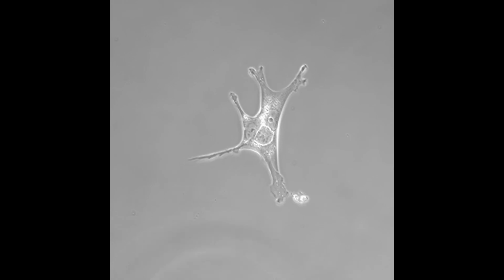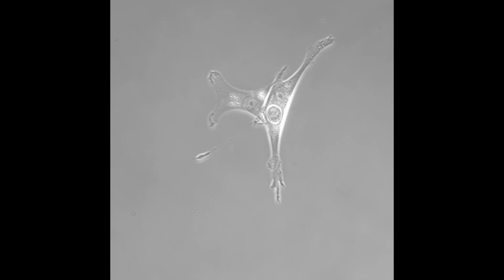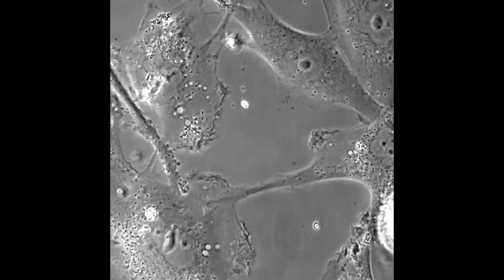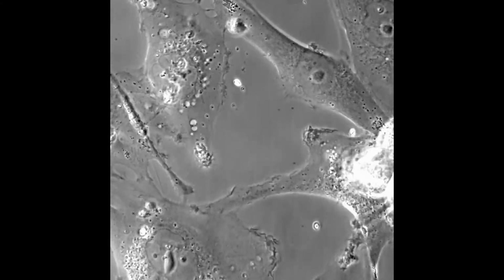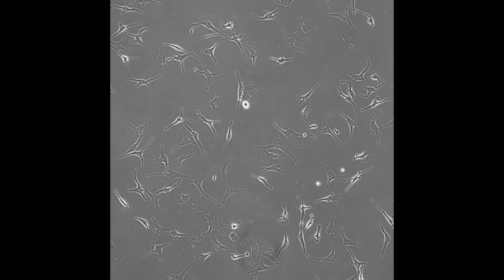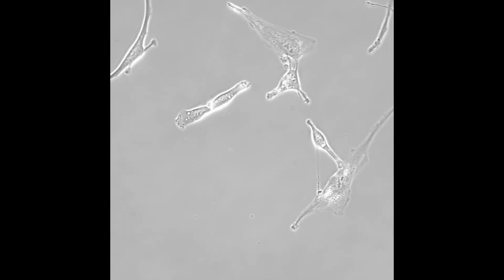At the core, all the living creatures on our planet are made of tiny units. They're called cells, like the ones you see here. Each of these cells is alive. It's eating, moving, communicating, and working tirelessly to create the tissues, organs, and all the other systems so vital for us. Individually, they are small, but together they create something far greater than themselves. It's us, humans, and all the other living creatures.